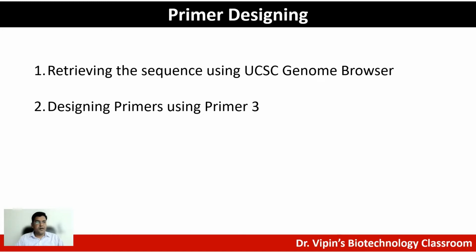So welcome back to my Biotechnology classroom. And today we discuss a very common experiment. This is something that anybody who does biotechnology cannot escape, because if you're doing biotechnology, you would at some stage do a polymerase chain reaction.